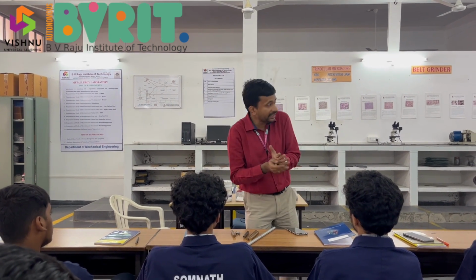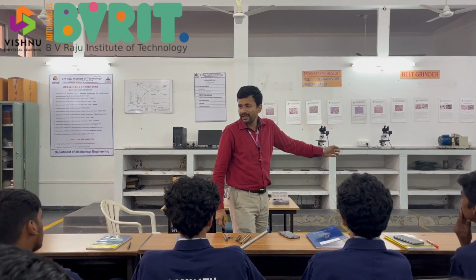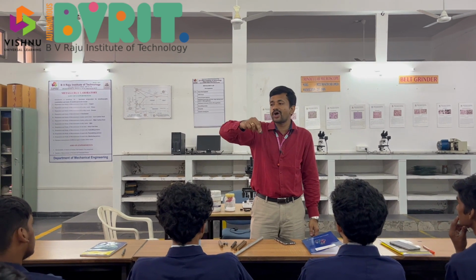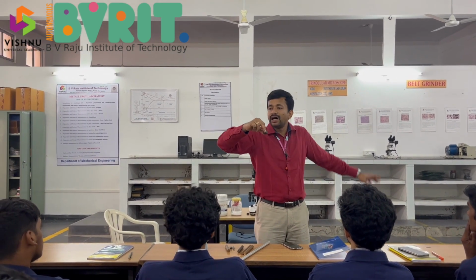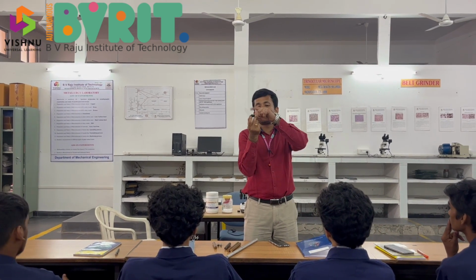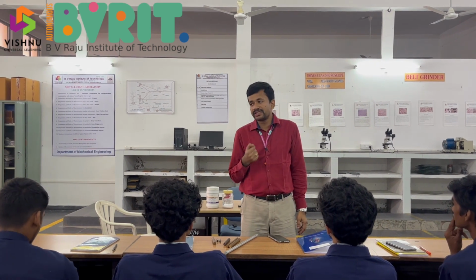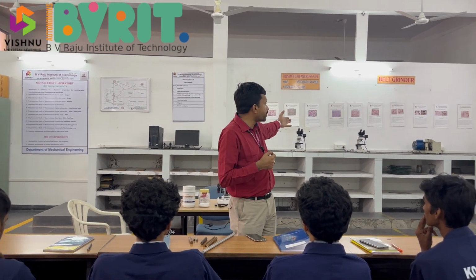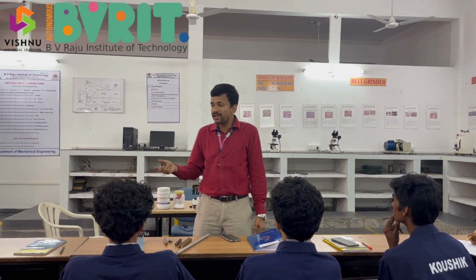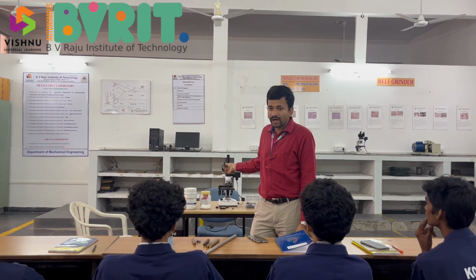So there is another equipment called a belt grinder. It is nothing but a flat surface belt grinder, so that when you position the specimen on top of that belt grinder and make it operate, you will get the upper top surface flat. Okay, so that is the first thing after we do the hydraulic mounting press. So, belt grinder. After the belt grinder, can we keep it under the microscope? Yes, and then what can we observe this time?